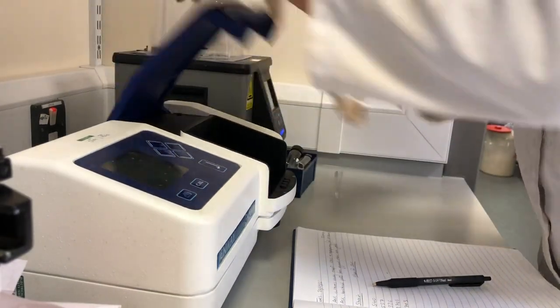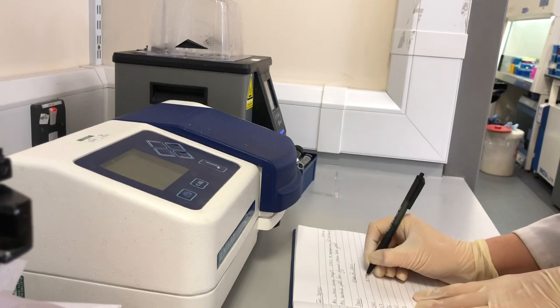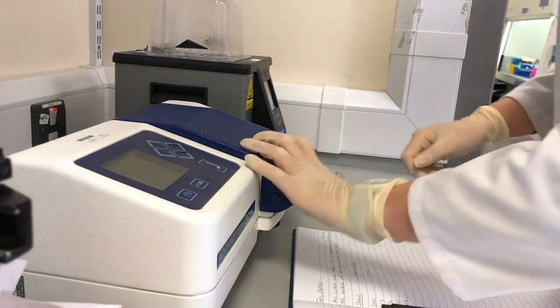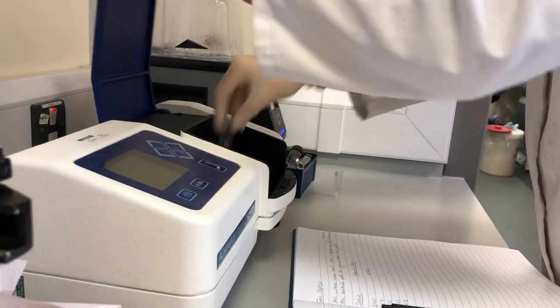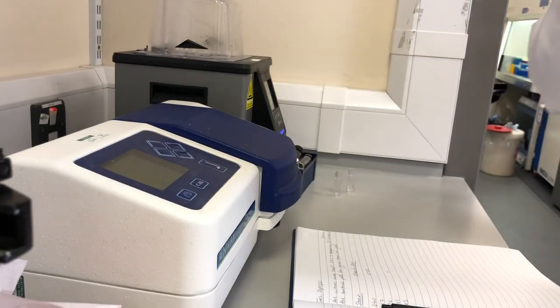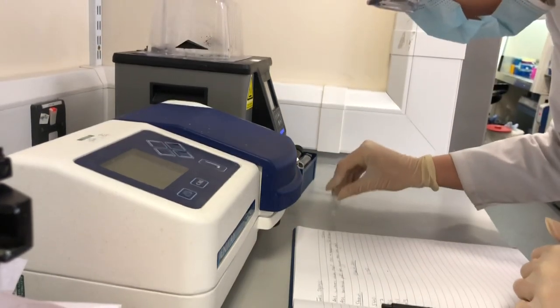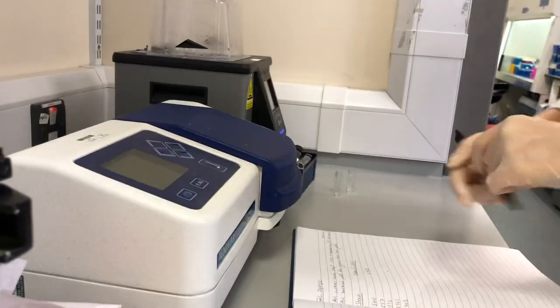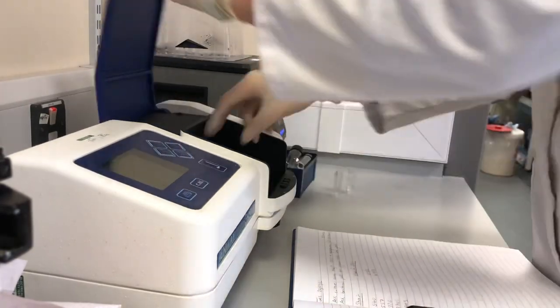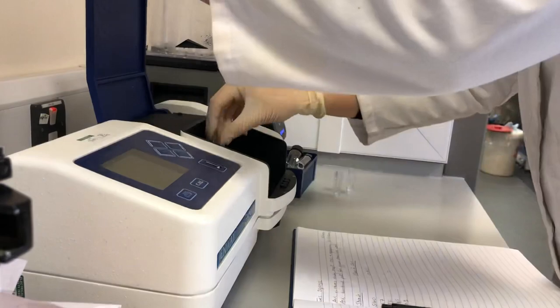This instrument gives you values depending on how cloudy or how transparent your solutions are. In simple terms, if the solution is more cloudy, it means you've got a higher density of bacterial cells in the sample, which means they've grown more. So here I'm just taking measurements for all of my bacterial strains to see how much they've grown and whether they're ready to use yet.